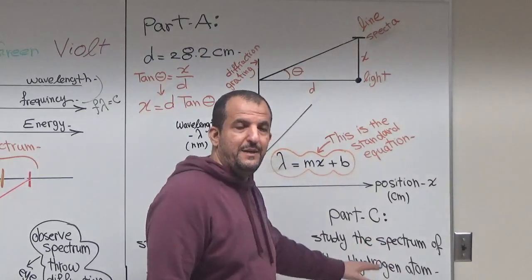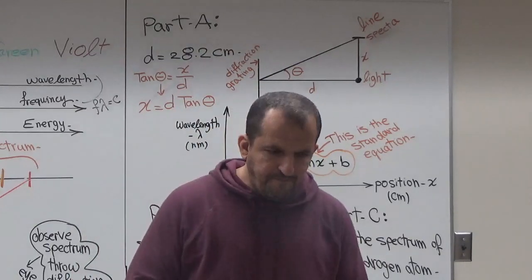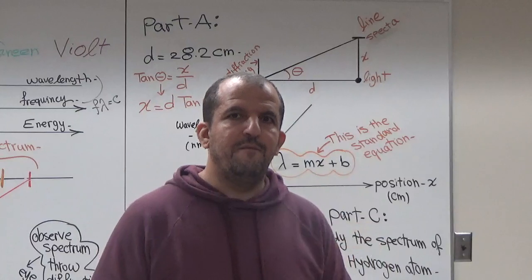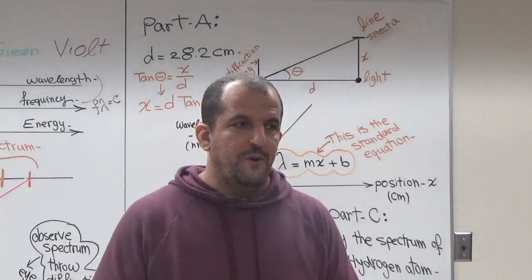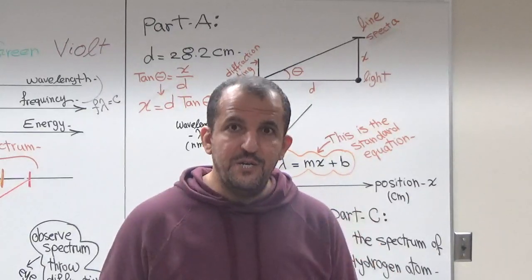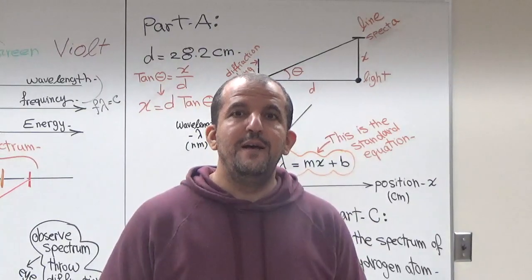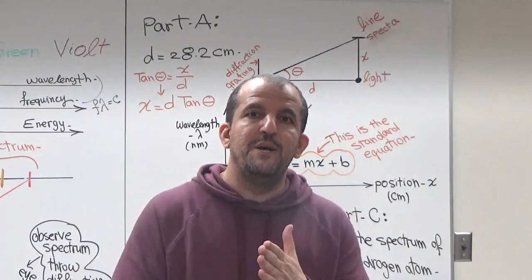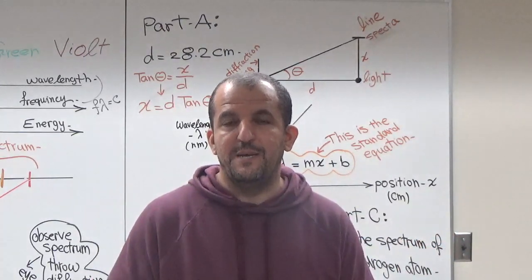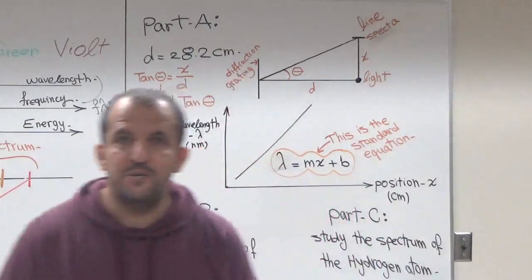So we will use this data, which is the spectrum from the hydrogen atom, in future topics. So this is a very nice experiment. This experiment can help you to learn how you can have a fingerprint for each atom in this world, just using a simple idea, which is spectroscopy, atomic spectroscopy.